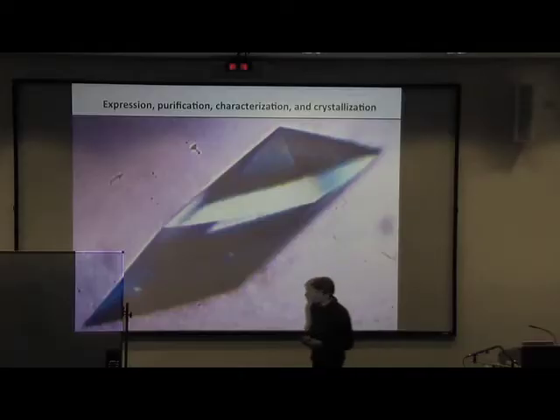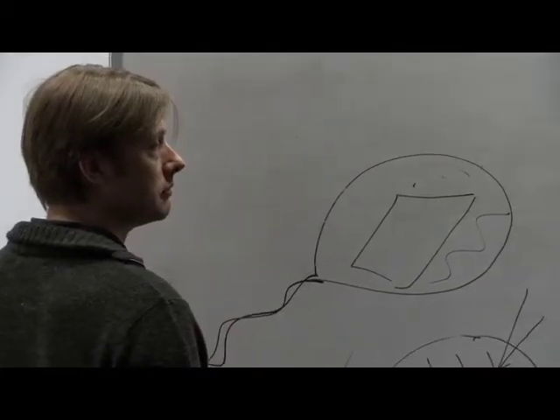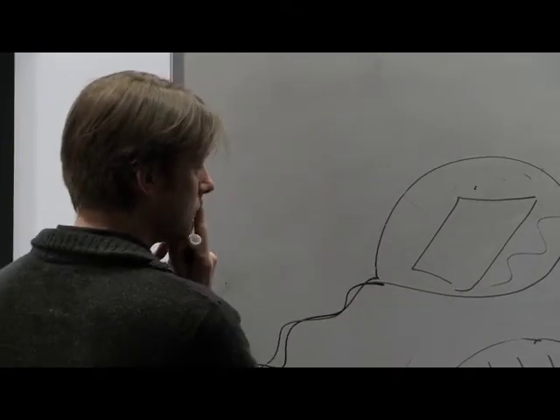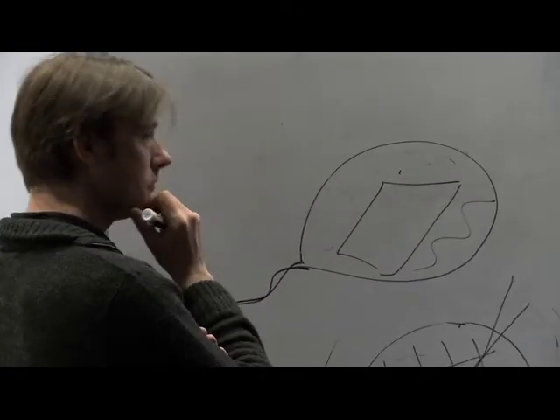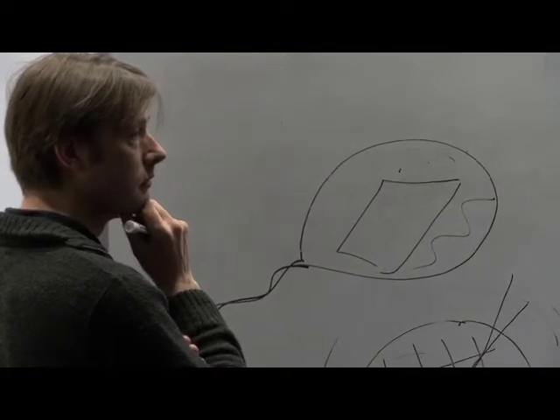The biggest problem is that the change in volume upon freezing needs to be similar between the liquid around it and the crystal. Because if it isn't, you will destroy the lattice of the crystal, which you detect very easily. That's like a 1% change, right? Yeah, but that's enough. So in cryo-EM we don't worry about this because you don't know that this happens. But in crystals you can see it happen, and you very often get distortion of the crystal lattice.